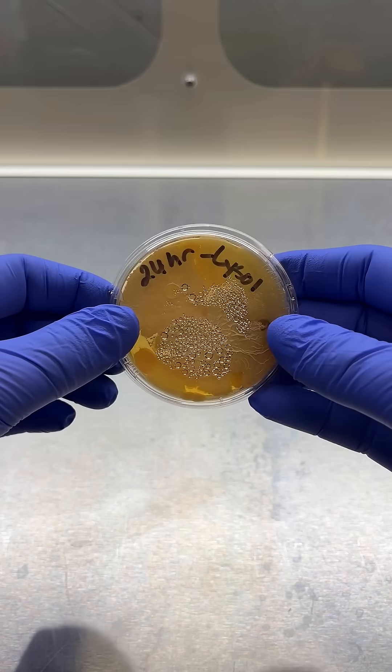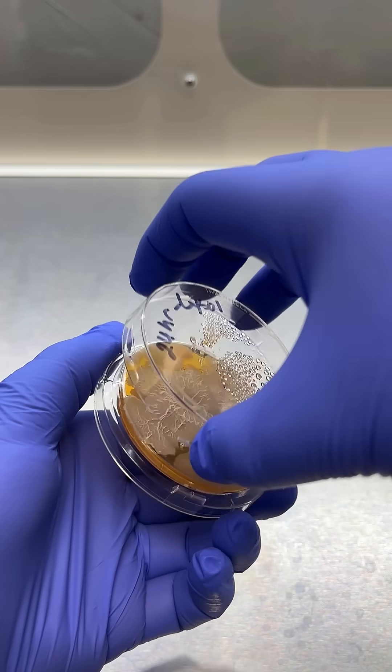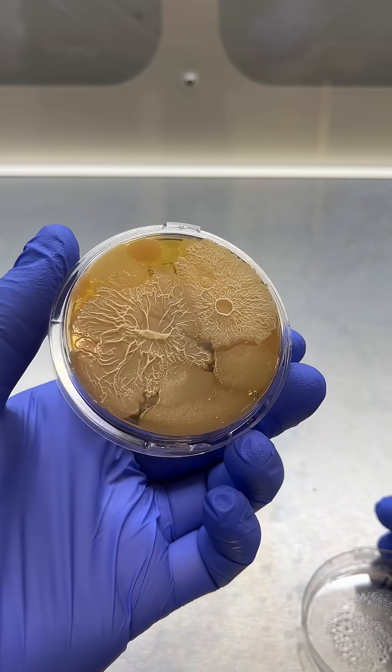And finally, the 24-hour plate. Bacteria is back and it's thriving. Looks a lot like the before plate, doesn't it?